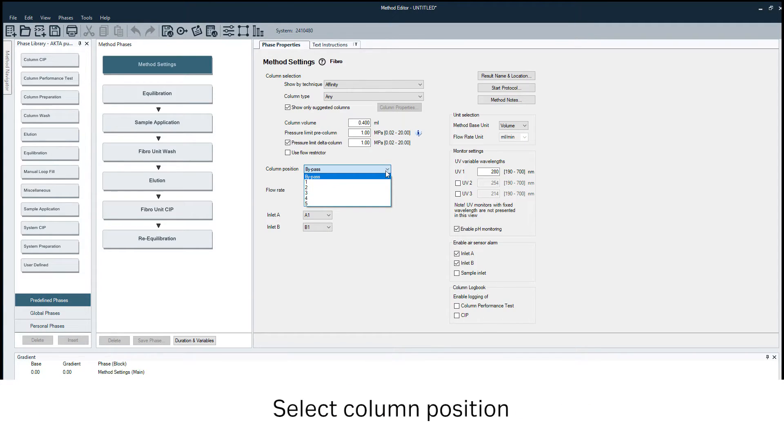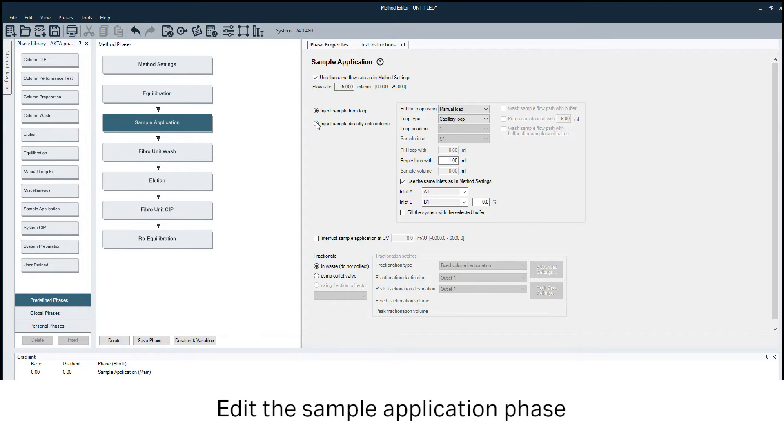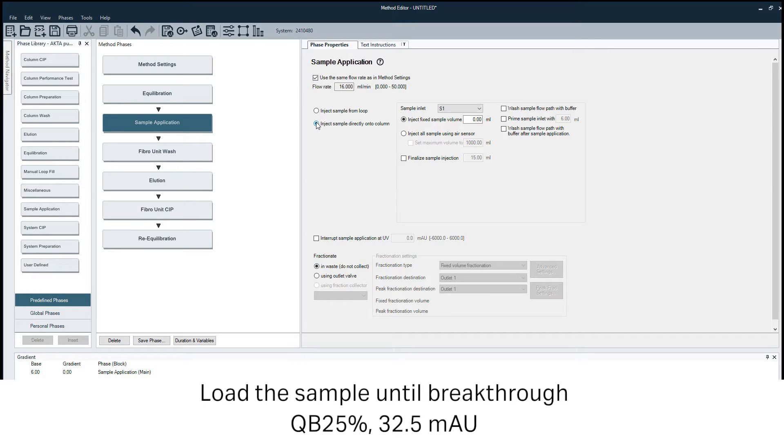Select the column position. Load the sample until you reach or exceed 25 percent breakthrough.